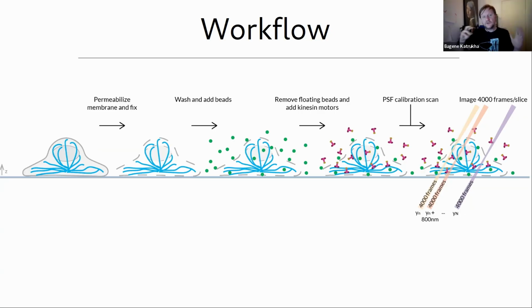Because of course, if we want to track individual kinesins, right? So if we do the volume, if we scan something like even 30 frames with the lattice light sheet, when you scan and come back, this motor couldn't bind or it already moved, so you kind of don't know what to do. So instead, what we did, we actually parked the light sheet in one specific position.